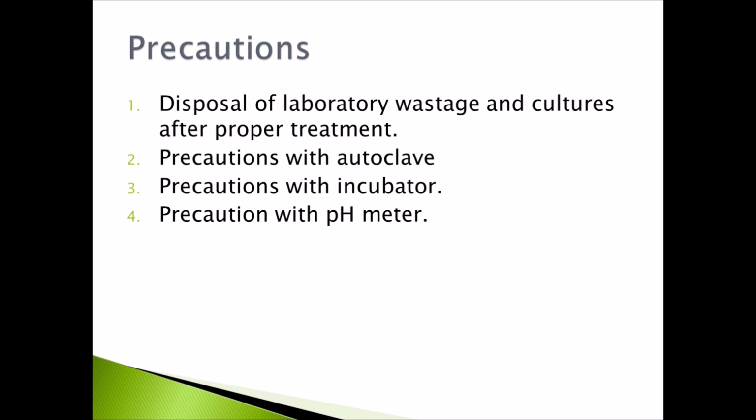Now, precautions with the autoclave. The level of water should be checked before operation. The air should be completely evacuated and the steam must have access to the materials to be sterilized. The cotton or glass beads must be sterilized in a glass container closed with foil.